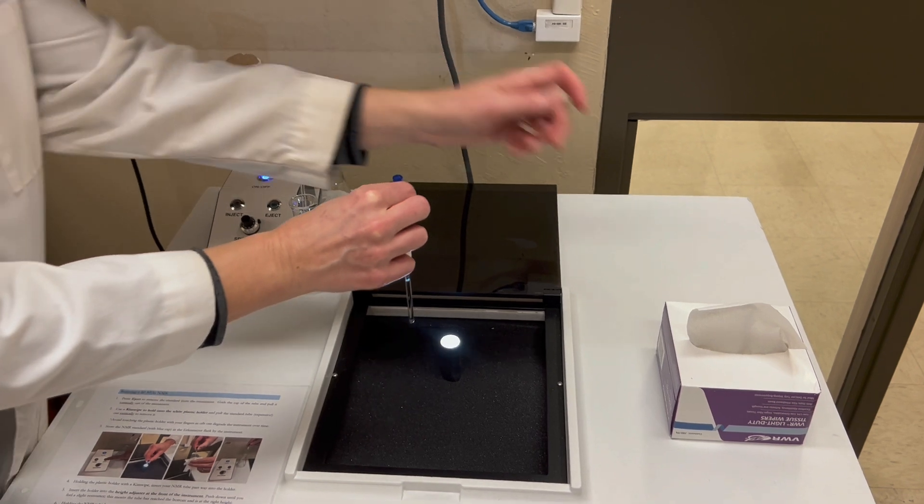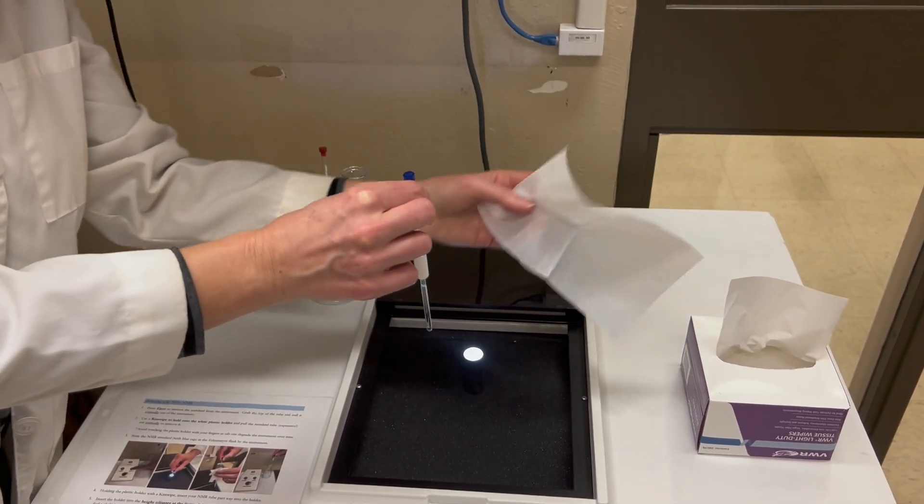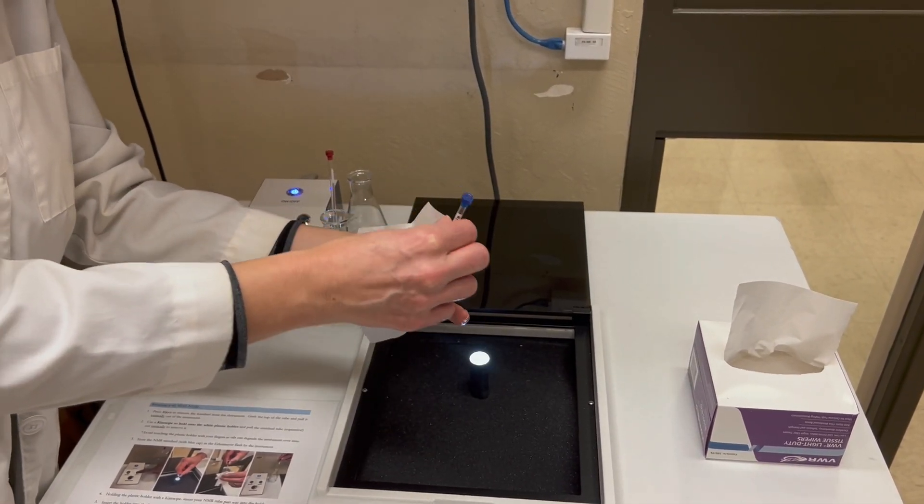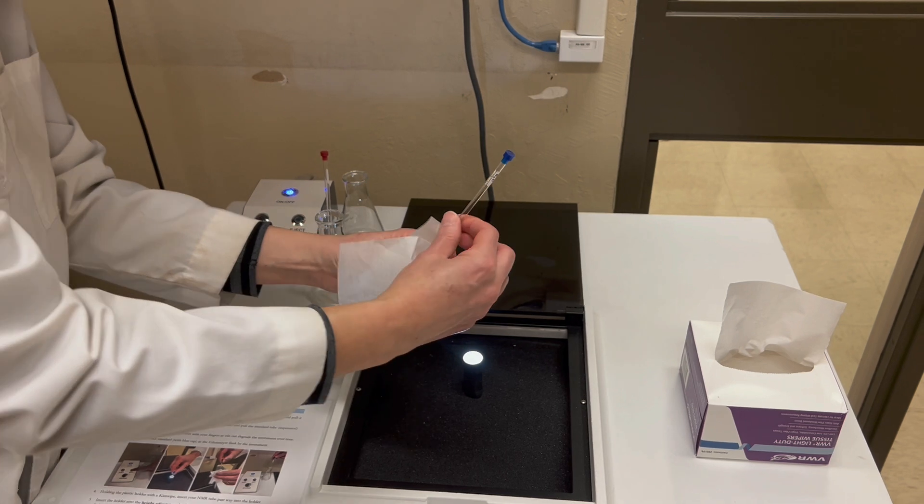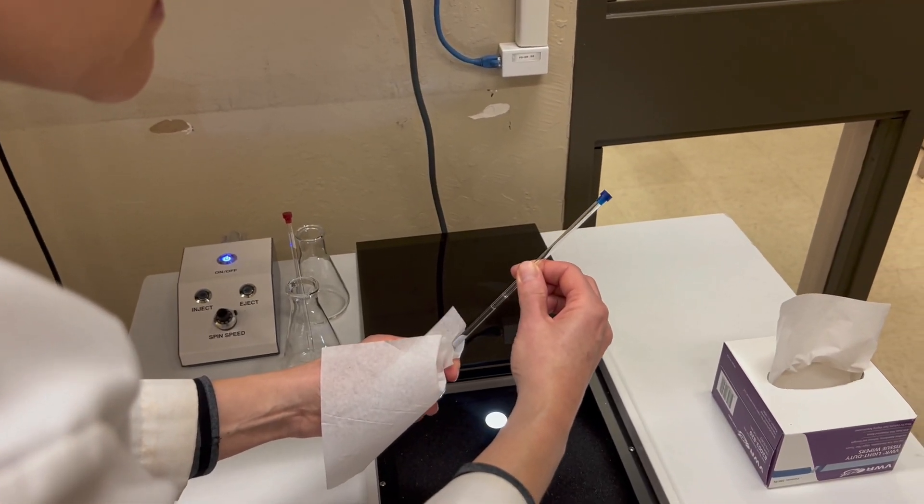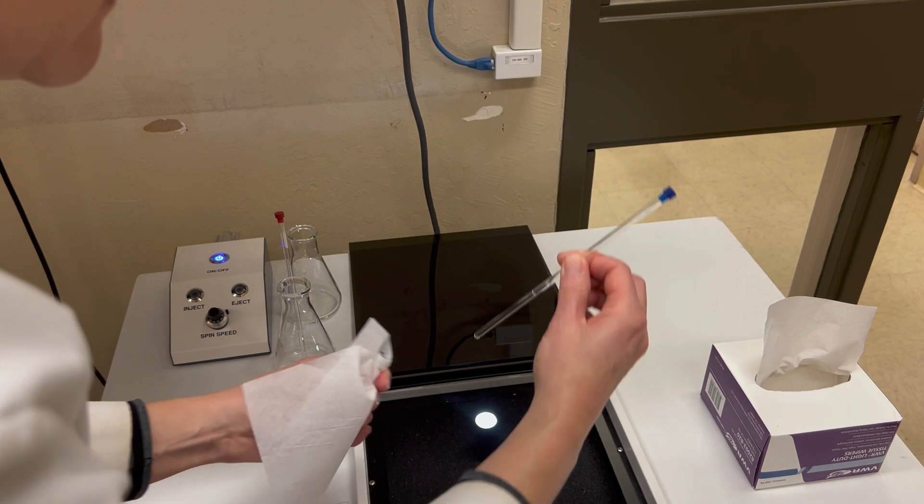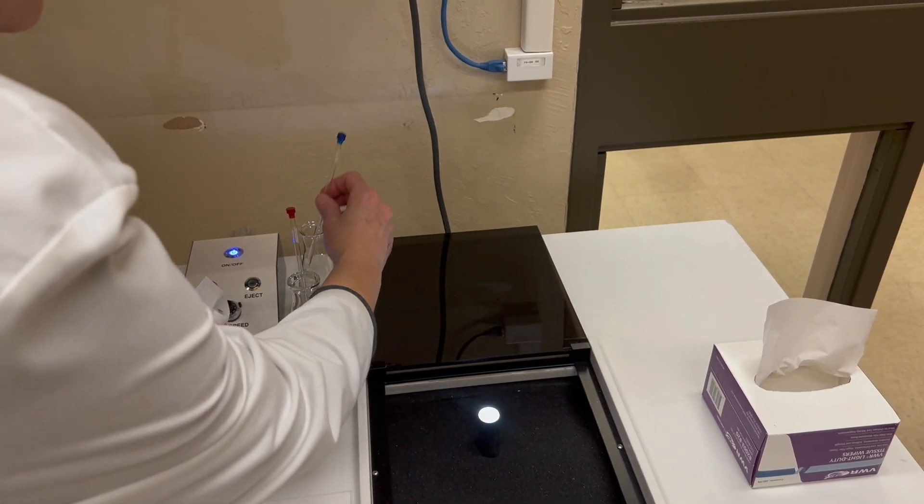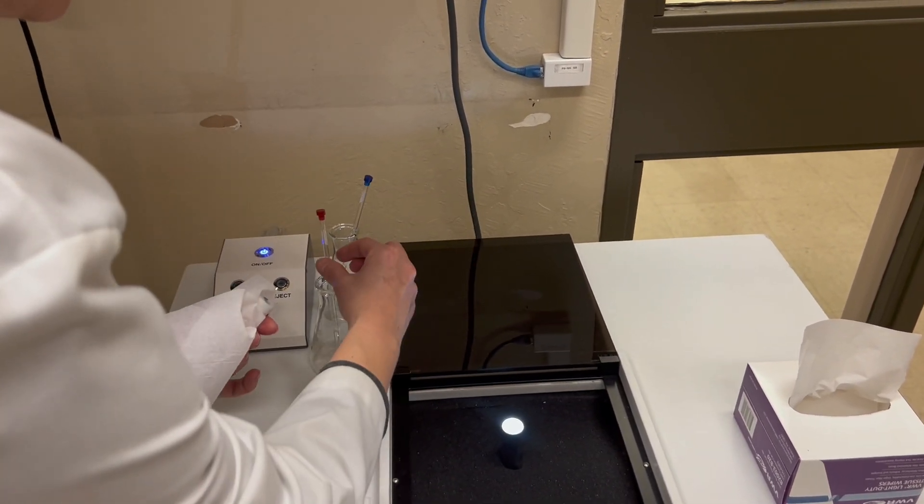Lift that out keeping it very vertical so that you don't snap it. There's this little plastic holder that will hold the sample. If we grab that with our fingers we'll get oils from our hands onto that spinner, which over time will cause us some problems. So let's hold onto that with a kimwipe.